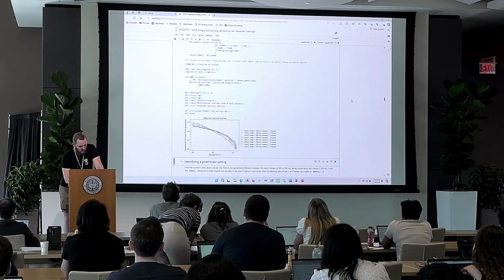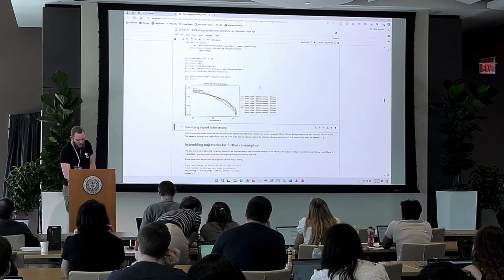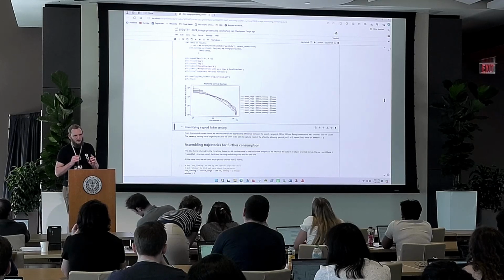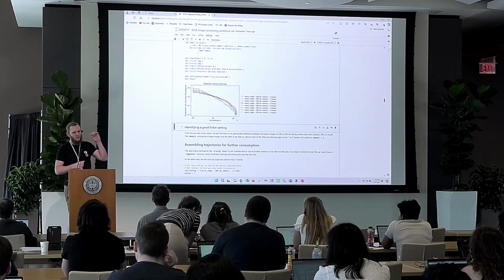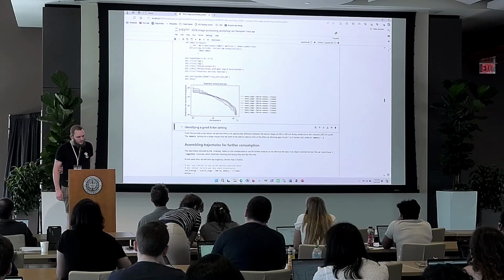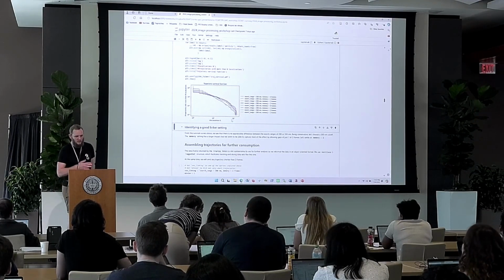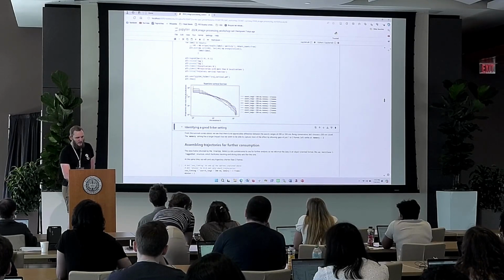Then what I'm plotting down here are the survival curves of the trajectories. On the x-axis is the number of localizations in any given trajectory. Now we're working with this data frame we got back from the linker call, where we have identified which localization from Thunderstorm belongs to which particle. On the x-axis is the number of localizations per trajectory, so how many frames do we have, and on the y-axis is a cumulative count. Basically, how many trajectories are longer than the value indicated on the x-axis.